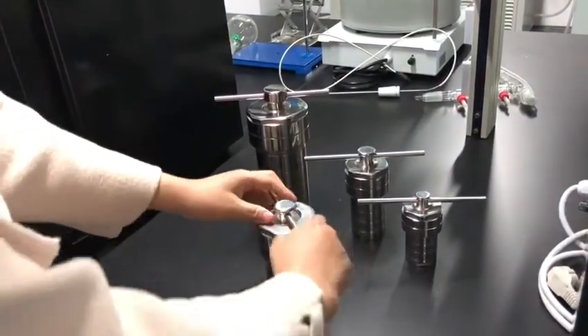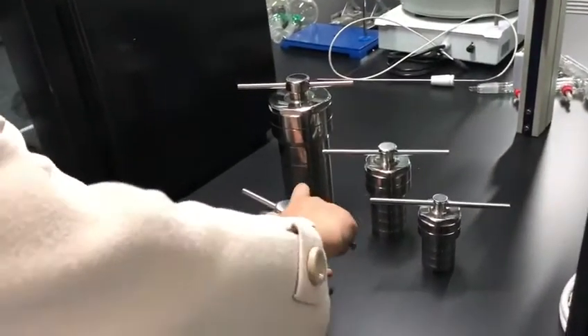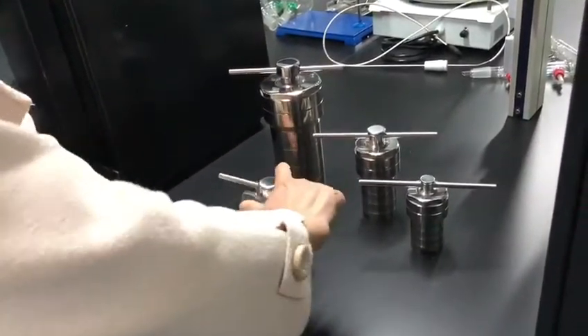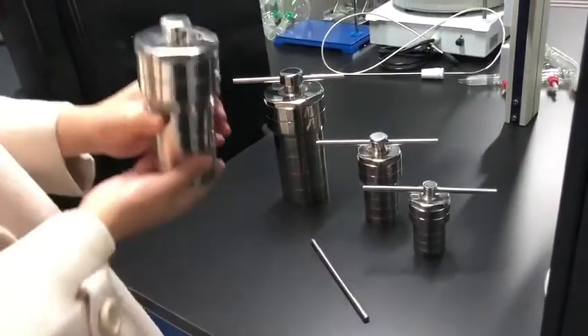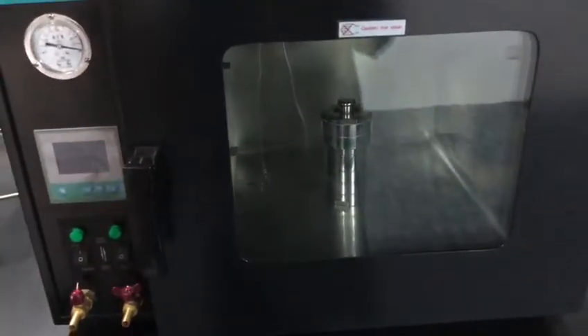Use the bar to make it tight. Then put this one inside the oven and start the oven.